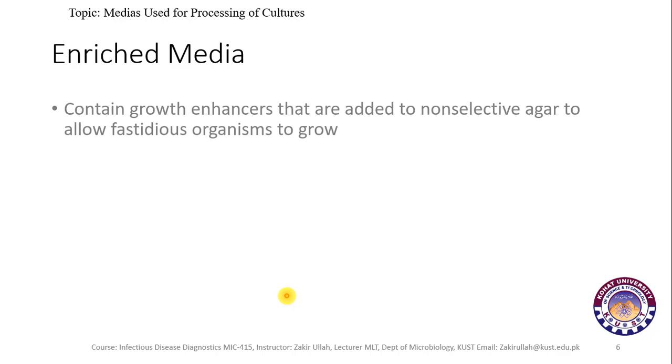Enriched media is a type of media which contains growth enhancers that give support to fastidious organisms, and certain enhancers are added to non-selective agar. So, that non-selective agar then becomes a good enriched media for the fastidious organisms.